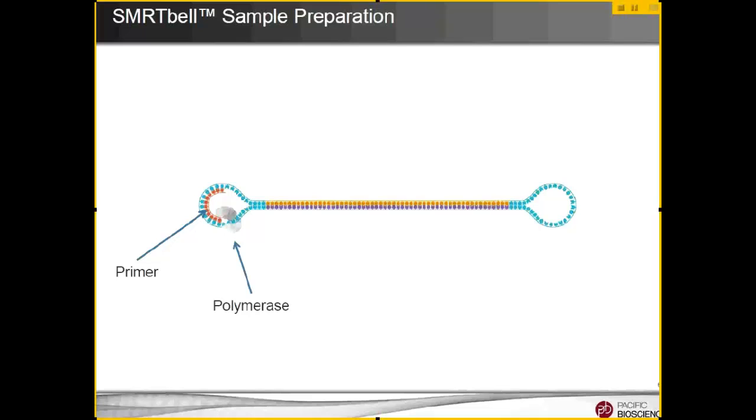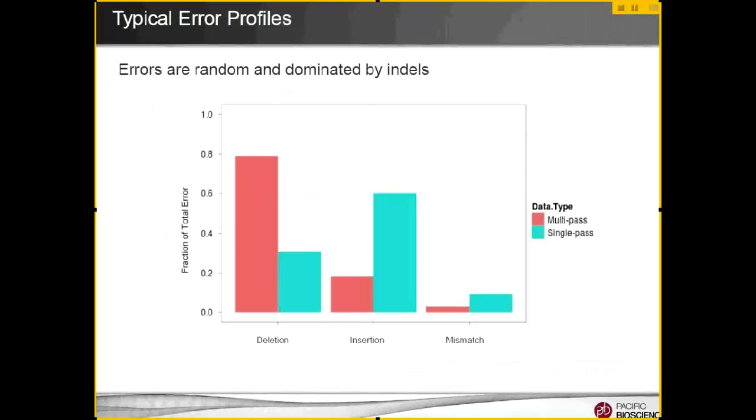One of my friends from grad school was working in their reagents department for a while, and apparently the mix of reagents they use is a very complicated mix. They apparently have just been throwing everything they can in there. It's kind of like a fracking mixture. It's got all sorts of weird stuff in there to slow the reaction down or speed the reaction up or make the polymerase more stable. And they're partly working on that to come up with a way so that it will always start sequencing at the beginning.